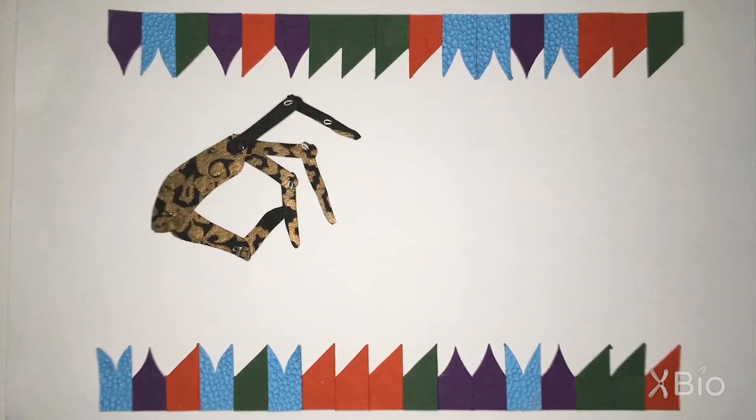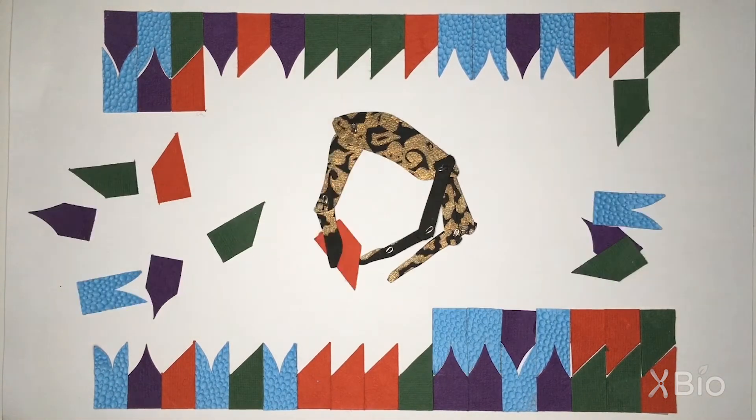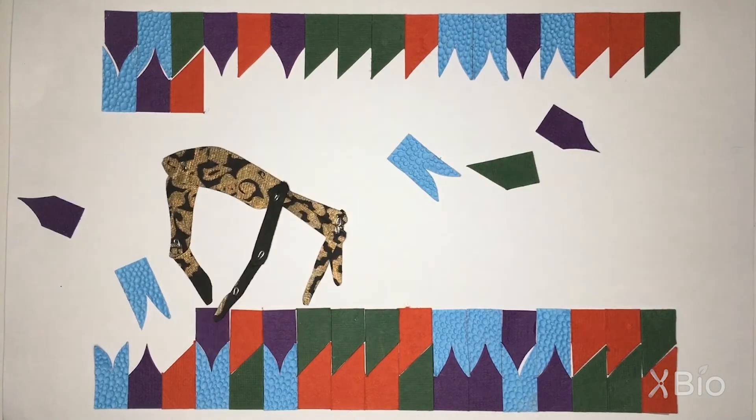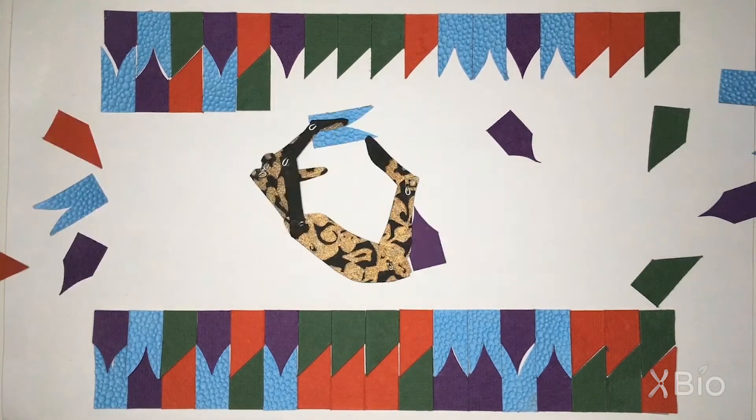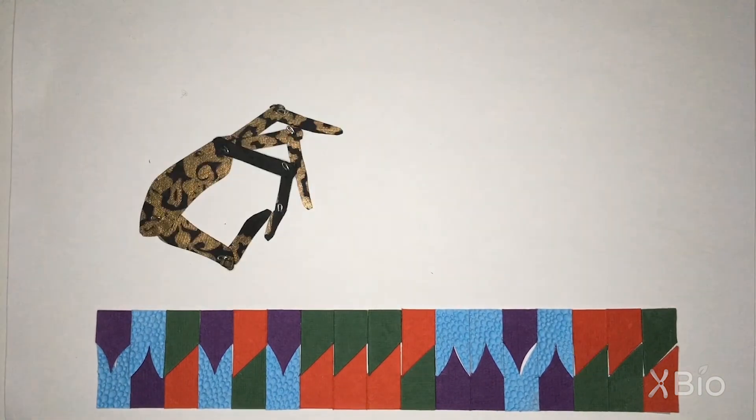But anyway, the complementary strands are pulled apart, and primers stick based on the order of their nucleotides. They act as signposts for DNA polymerase to start running along the DNA template strands, pulling in complementary bases one by one by one, until two new copies of the piece of DNA are finished.